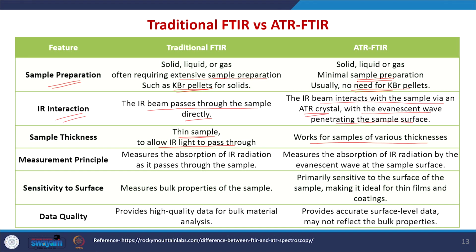The measurement principle for the traditional FTIR is that it measures the absorption of IR radiation as it passes through the sample, whereas in case of ATR-FTIR, it measures the absorption of IR radiation by the evanescent wave at the sample surface.